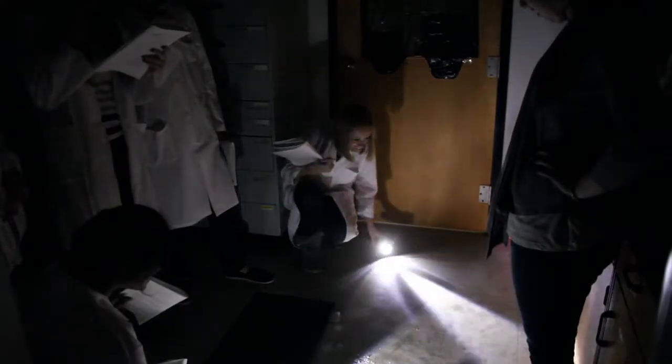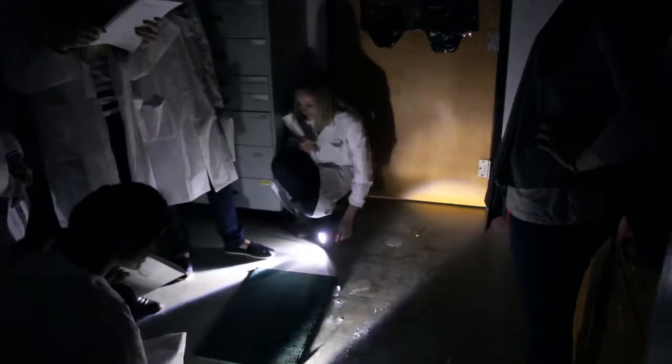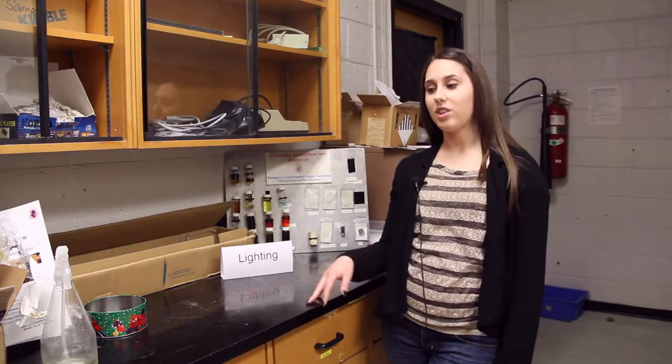We have oblique lighting as well as alternate light sources. Both types of lighting are extremely useful in forensic investigations due to the fact that all evidence is not necessarily available to the naked eye. So what we do here is we use oblique lighting to just enhance latent fingerprints, footwear impressions, as well as trace evidence such as hair and fibers on surfaces such as countertops, glass windows, and the floors.